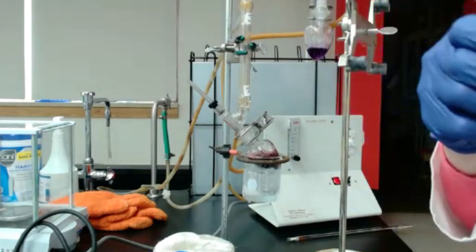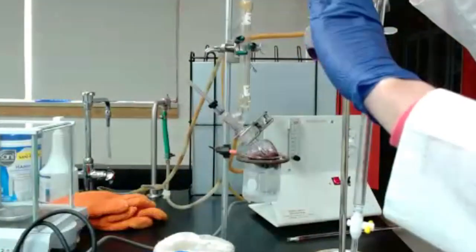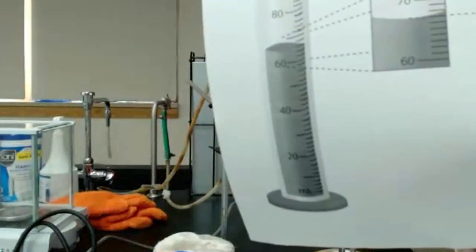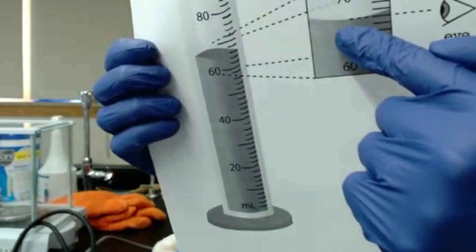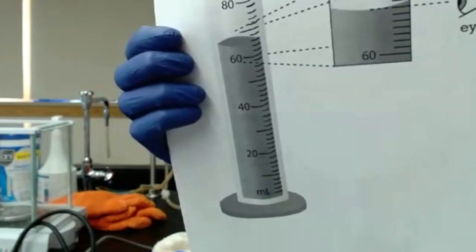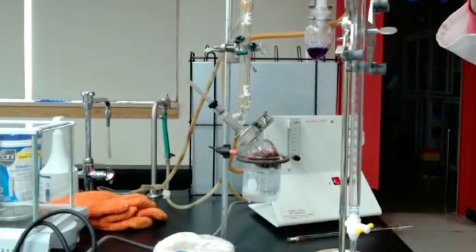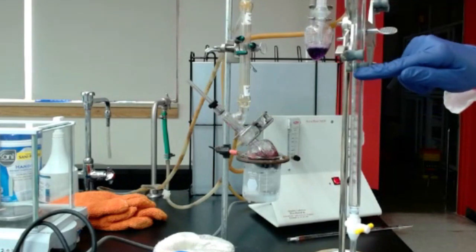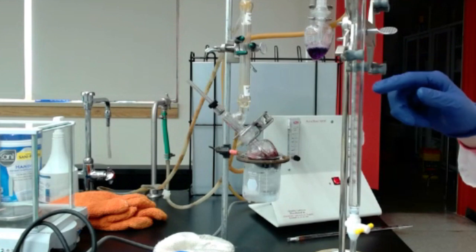And then you have some graduation on top of it. So let me put it back straight. Graduation, that's where you will need to look really straight. Your eye should be at the bottom of the meniscus, just making sure you read correctly. Sometimes, depending on the burette, I have a 50 milliliter burette, so my numbers start from 26 at the bottom, and then 25 is up. Or here it's 40 and then 39. Depending on the burette, that might be the opposite. So make sure you read in the correct direction.